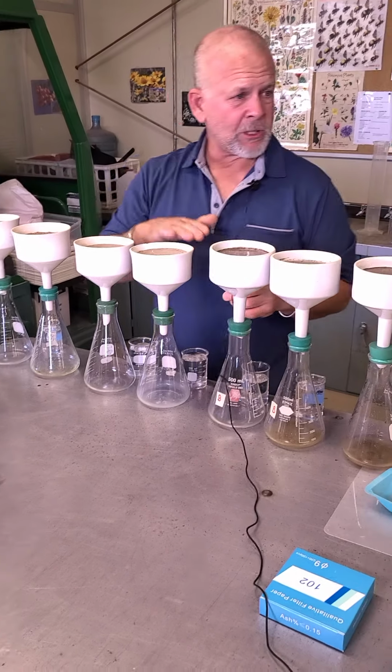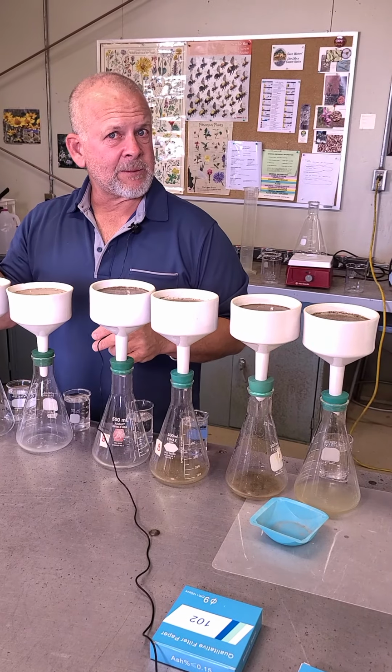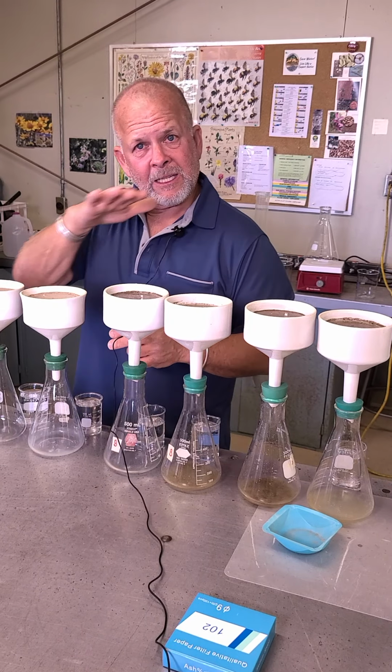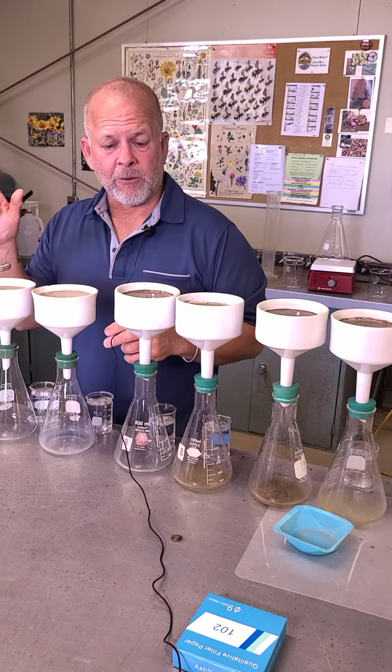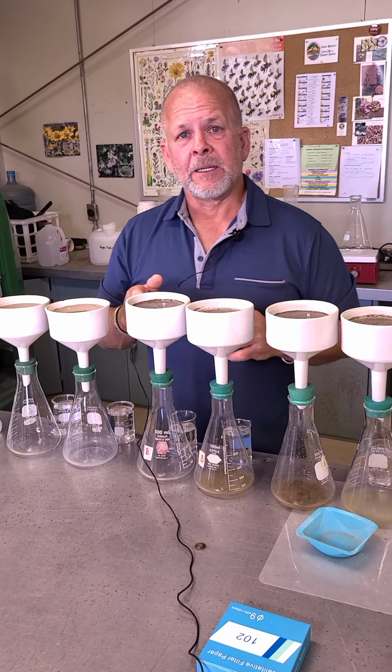I'm going to go back and make sure that the heads are all the same, that we have the same amount of water through here, and then we'll let this experiment run. And then when we're done, we'll come back and we'll look at the volumes. And then this will be run 1. This will be the data that you get. This will be the data for run 1 that you'll see on your lab report, your lab exercise.